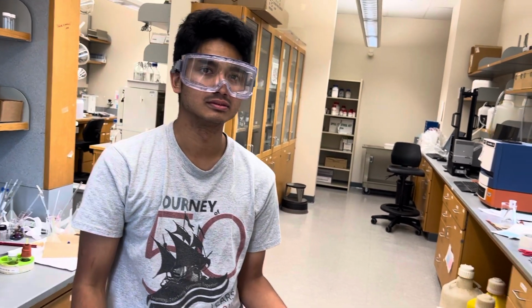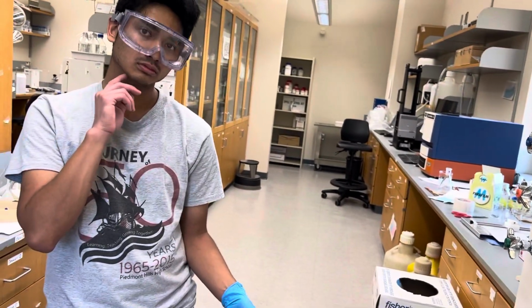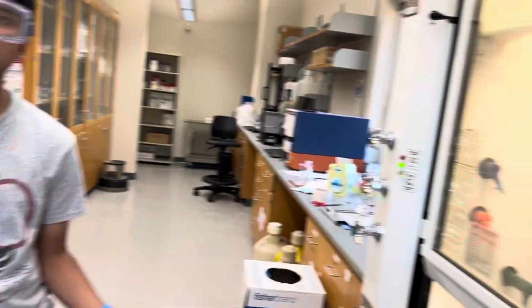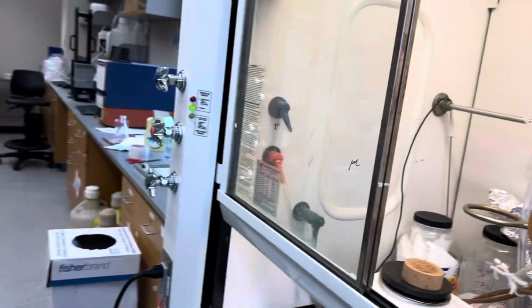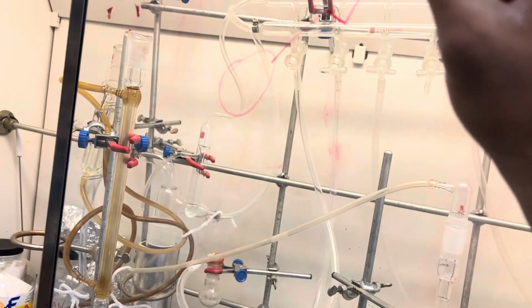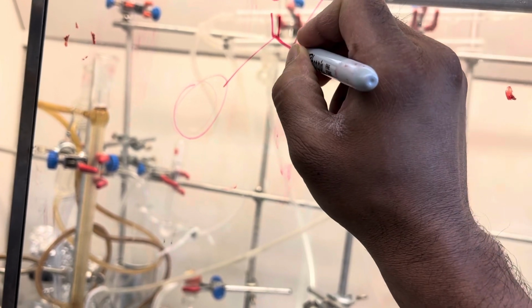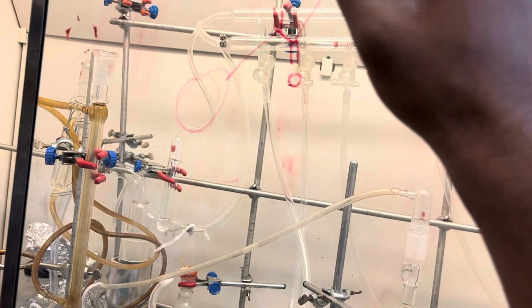Okay, I understand your point. Sometimes you can check the proton NMR, sometimes you can check the carbon NMR. For this reaction, which you already did, suppose you had some group close by, not on the carbon, or here or there. So this carbonyl group has some other group.